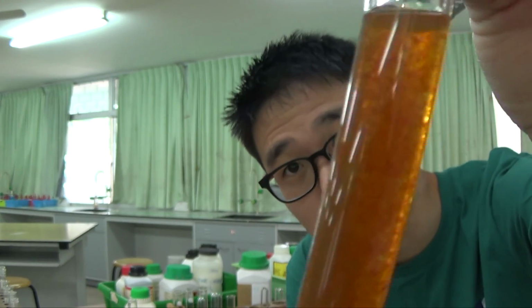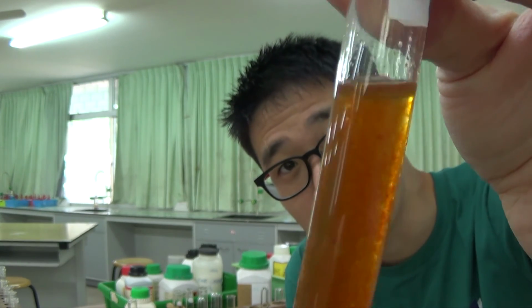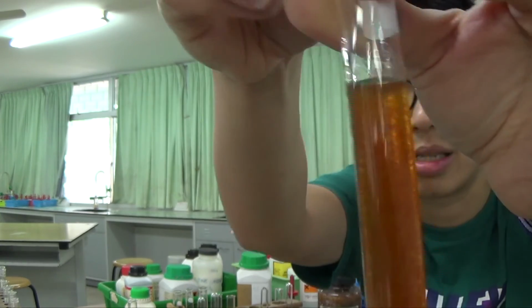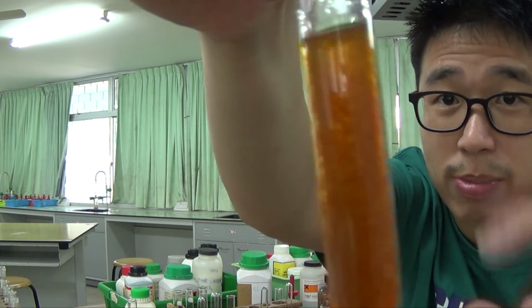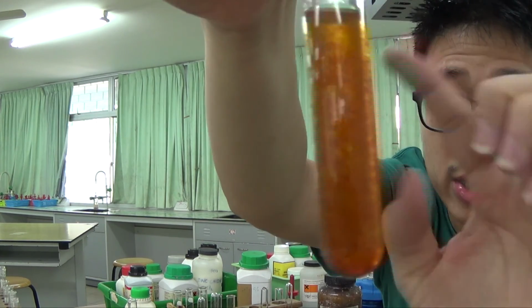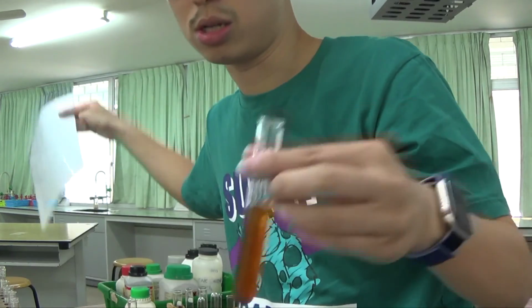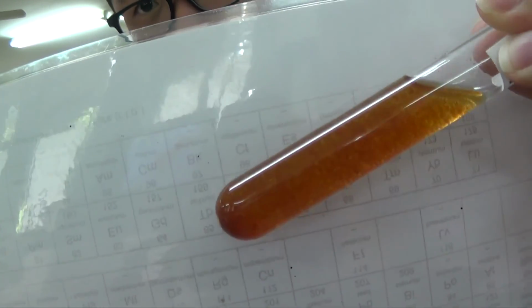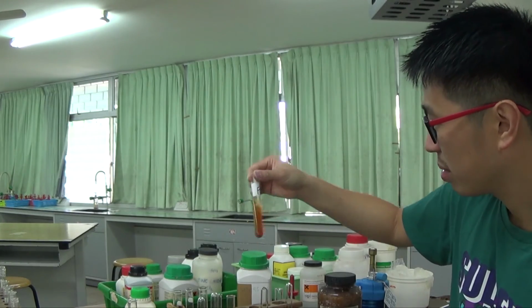It's like a suspension, so it's not a clear solution. Because it's not a clear solution, the precipitate does not dissolve in excess NaOH, okay? It's a suspension of the precipitate inside the solution. So it looks like it is dissolving, but it is not dissolving at all. There you go, you see a suspension of solid inside. So the precipitate is insoluble in excess NaOH.